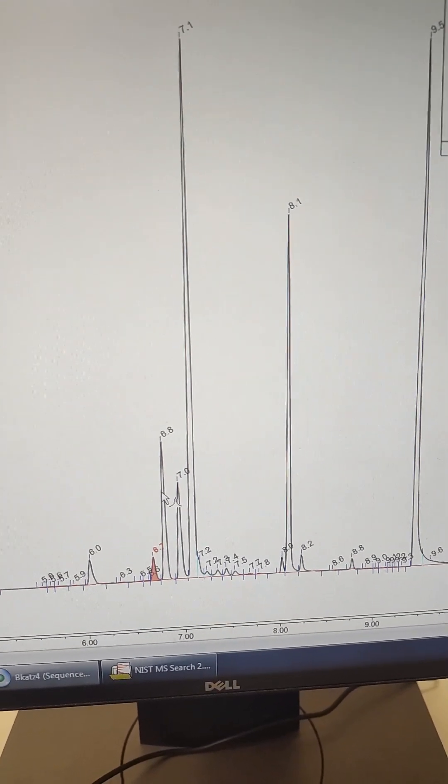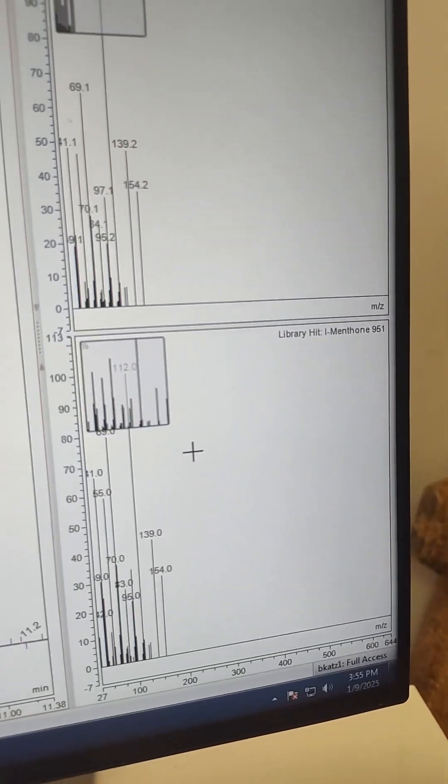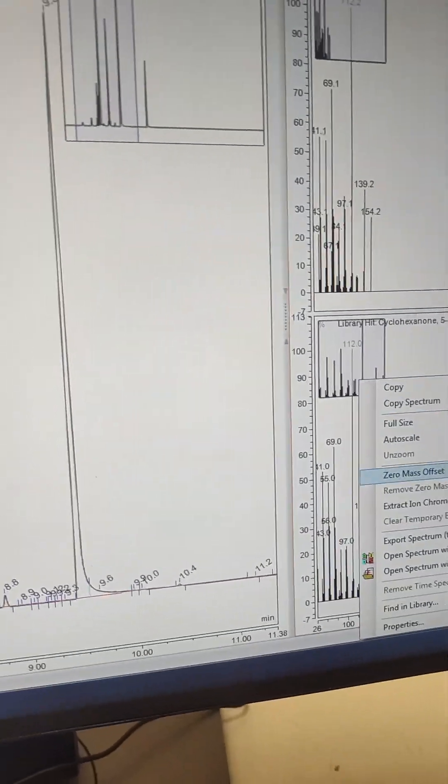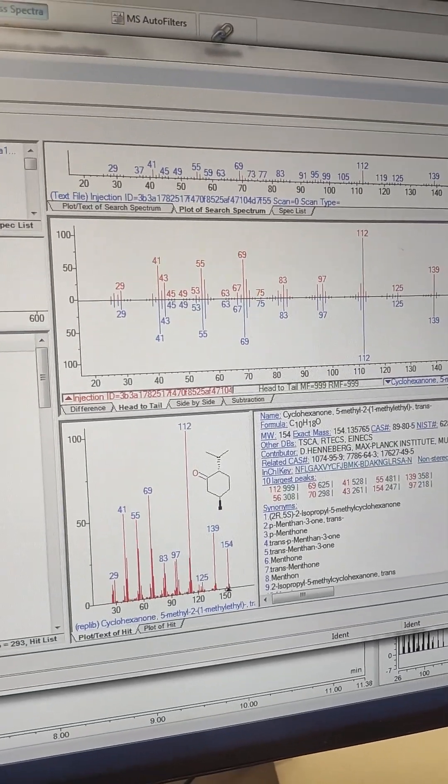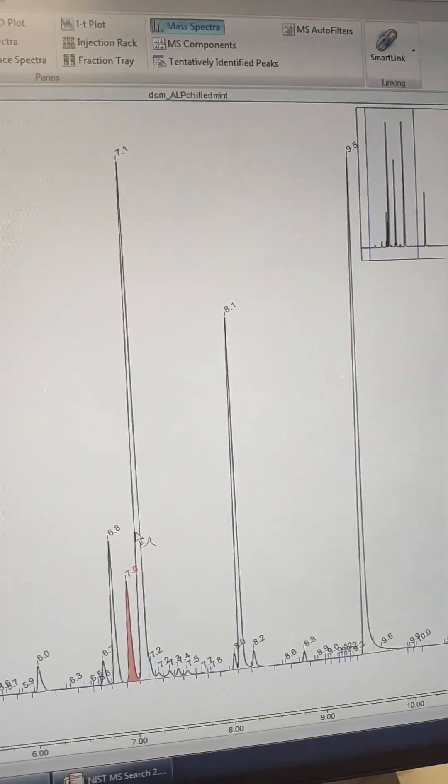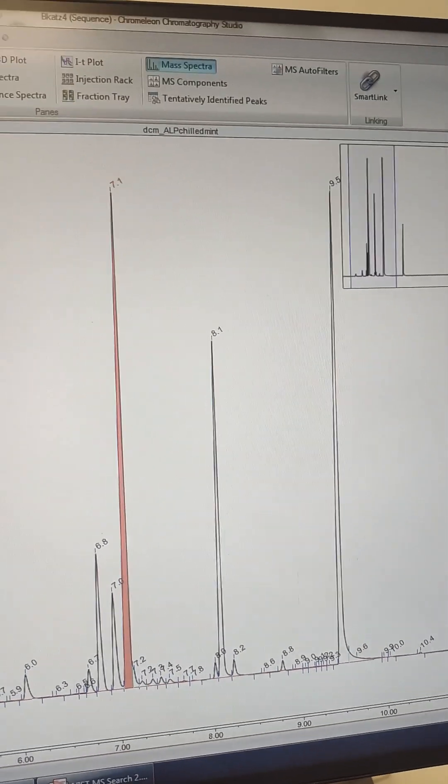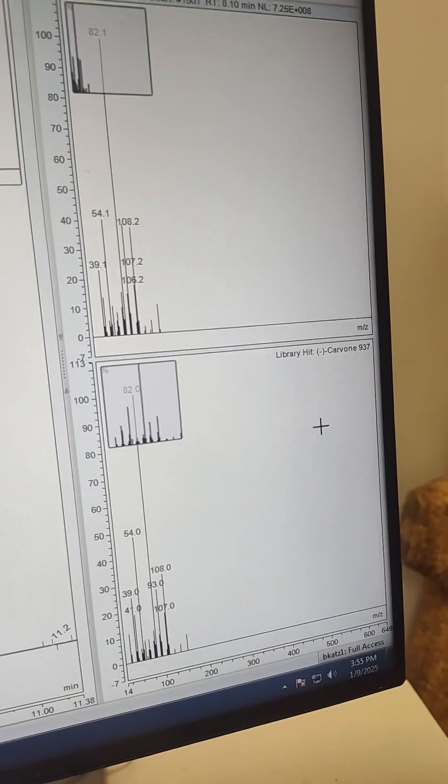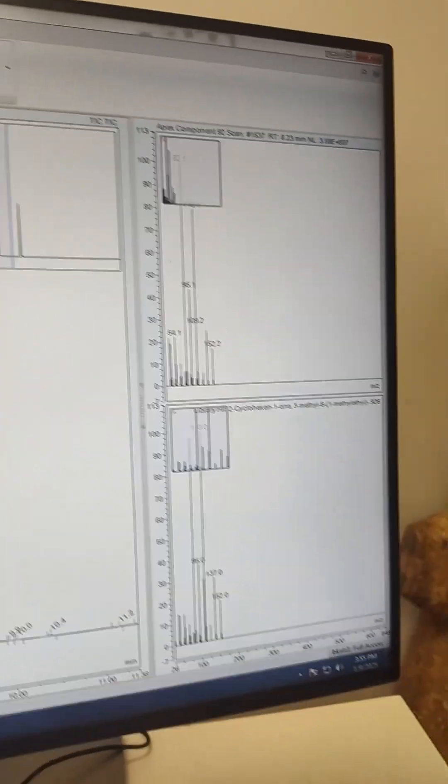All right, so 6.8 we have regular menthone, that's just menthone. At 7 we have another one, let's search it to get a name. That's another isomer of menthone, so lots of chilly mint flavors. This is the menthol that we mentioned before. And then the last big one here at 8.1 is carvone, that's your spearmint flavor. So there is some spearmint flavor.